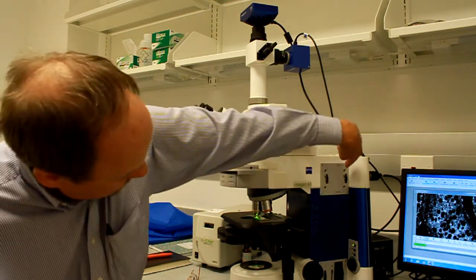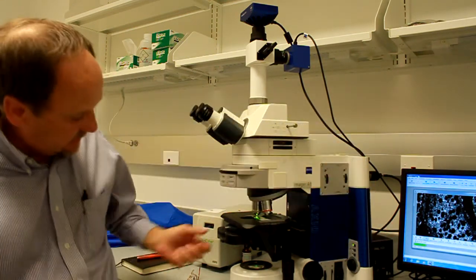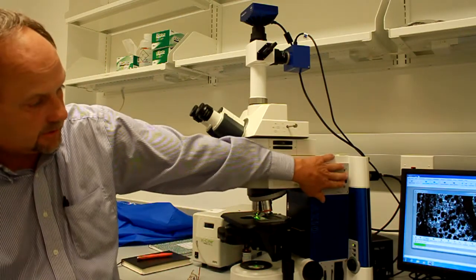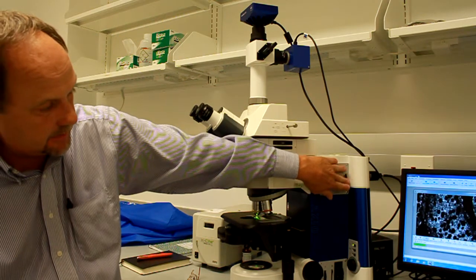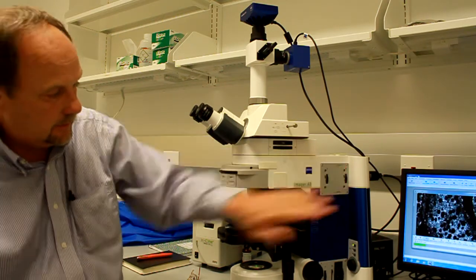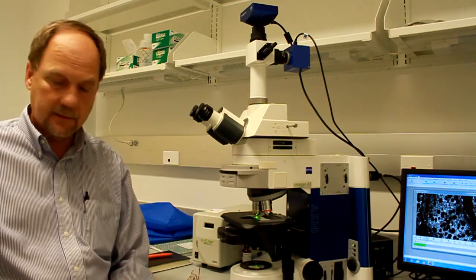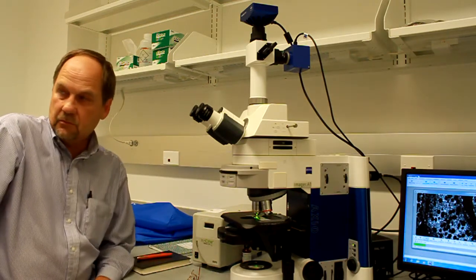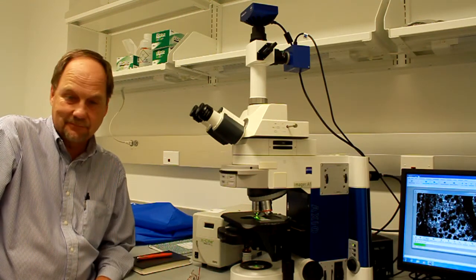This one that's called the aperture, the A, is the same as this one in the condenser. So you can adjust contrast with that, basically. If you close that down, it increases contrast. Nine out of 10 times in fluorescence, though, you'll have them both open. Just to let you know.